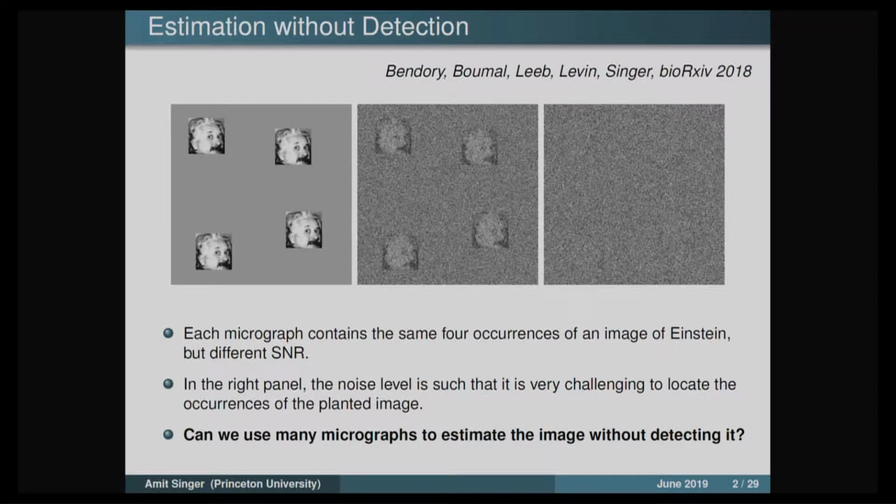In the middle, you see the same picture, but with a little bit of added Gaussian white noise. Now if I ask you to estimate the underlying image, you say, if I just pick one of them, maybe it will be too noisy. What I should do is pick all 4 of them. I can still pick the images with our eyes and average those. After averaging, I'll boost the signal-to-noise ratio, and this will be the estimation.